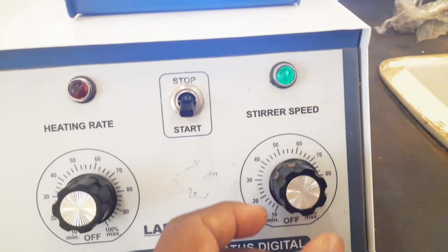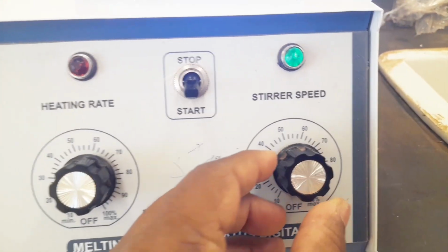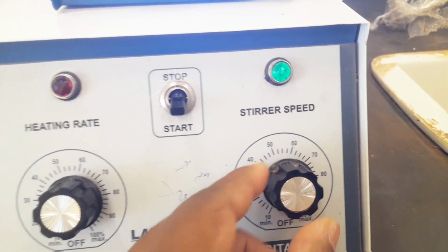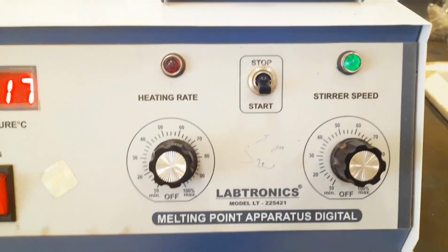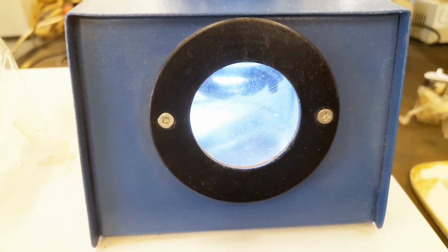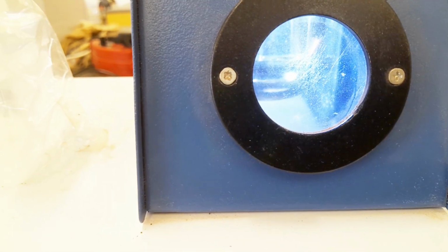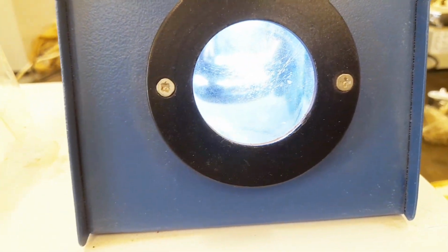And this is the stirrer speed. If you want the stirrer to work faster, we can increase the rate of the magnetic stirrer by means of this arrangement. So inside you can see the stirrer is moving. It's very clear. So this is how we have to arrange the sample. After completing the process, immediately note down the temperature at which the solid converts into liquid, and that gives the melting point.